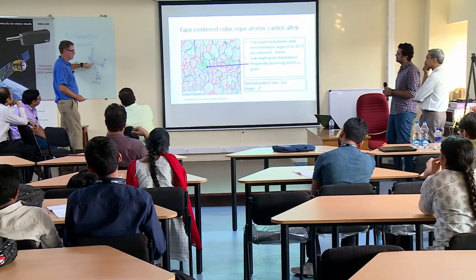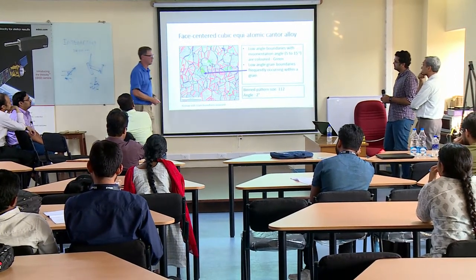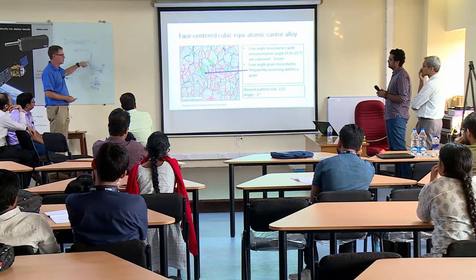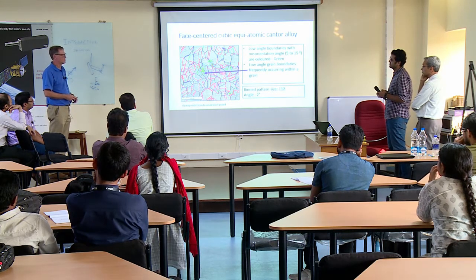And so I think this is usually due to that effect. Why it's localized is the part I don't understand. But what I find is if I recalibrate it and maybe even redo this pattern shift calculation, or PC shift calculation, that it tends to fix these problems.